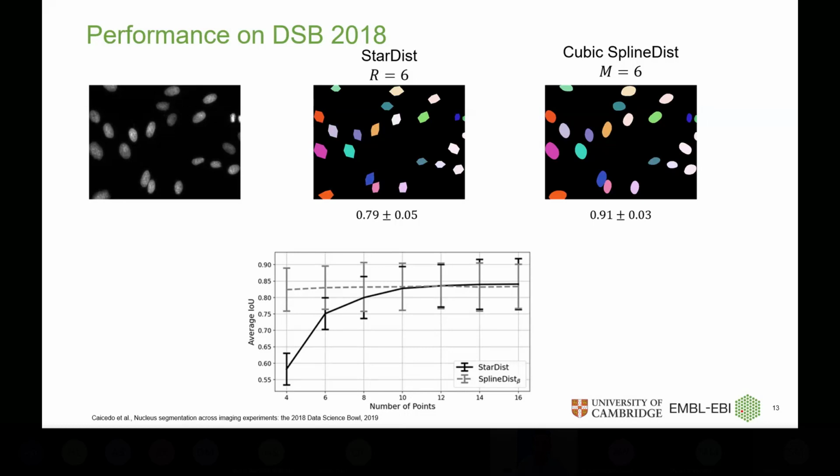Okay. Very well. Let me see if there's anything else that came in. Oh, Vitaly has a question here. Would it be possible to segment accurately when cells touch each other, and the labeling is primarily located at the plasma membrane, rather than a cytoplasmic label, as the ones that are illustrated now on the slide?